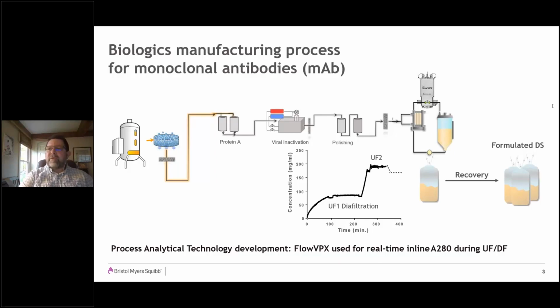And it has evolved, starting about 20 years ago, I think, when I would maybe date the modern monoclonal antibody process, when they came up with protein A capture. That was a significant advance to have an affinity column for monoclonal antibodies. And of course, they are a huge share of the market for biologics. So let me just go into what has evolved at BMS, especially, into a platform process, so that we now can sort of plug and play with a monoclonal antibody directly into this platform and come up with a nice pure product at the end.